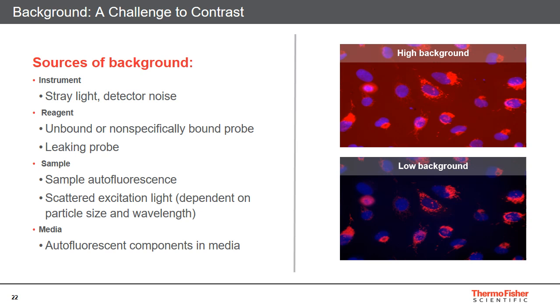As I briefly alluded to a couple slides ago, when we typically do these small molecule labeling experiments, we will often need to remove and wash out the label at the end of that incubation to remove any non-specifically bound probe. And so what this now of course leads to is the leaking out of that probe out of the cells, but it does remove much of that extracellular background that will be found in the medium.